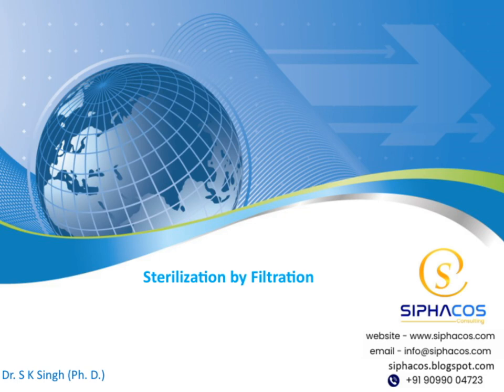We're going to be talking about sterilization by filtration, which is a crucial process in many industries. This presentation will cover the principles behind filtration sterilization, the methods used, and its applications. So, let's get started and explore this important topic together.